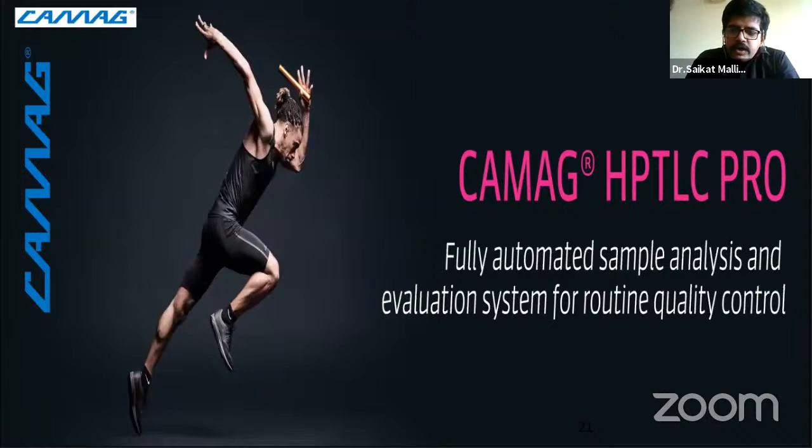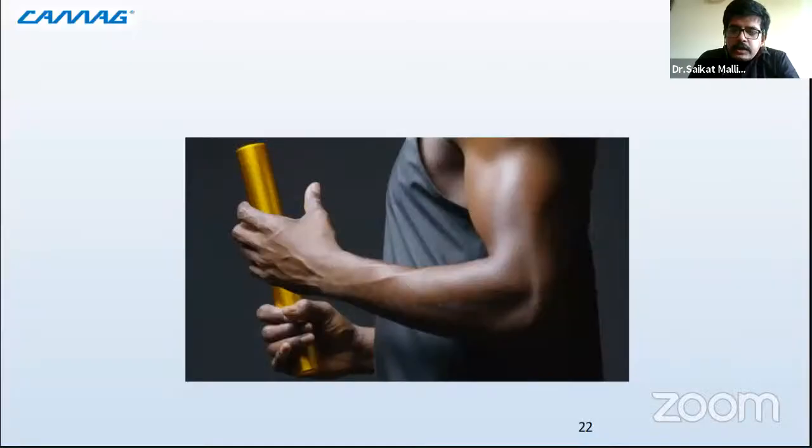Now when we move into the instrumentation part, we have generations of instruments which are coming up, and this is one of them, the HPTLC Pro, a totally automated version. I'll show you the video once we are done with the presentation part, because the videos are unfortunately not working because of compatibility issues. So sorry, excuse me for that.